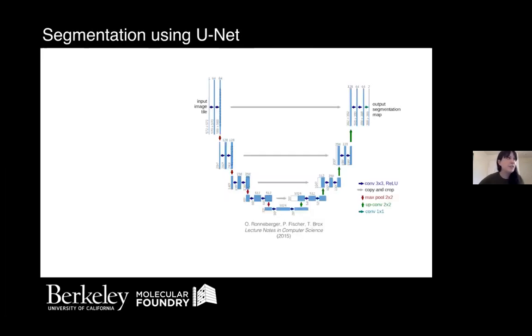Okay, and then this is a little detailed, so I'm going to go through this quickly and not dwell too much on the specifics for this discussion. But we are also very curious about our network optimization. We had done this in a way that was not terribly systematic, really just with the single goal of not overfitting.